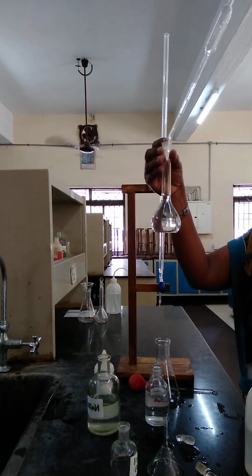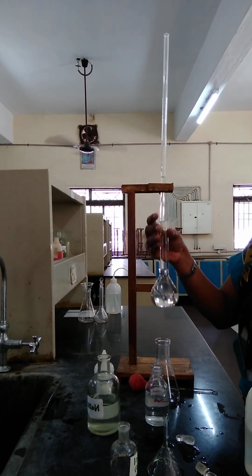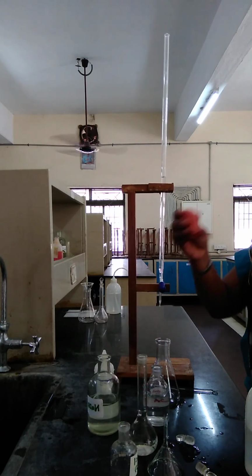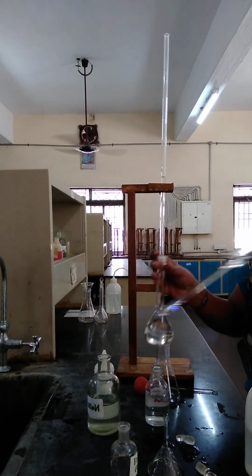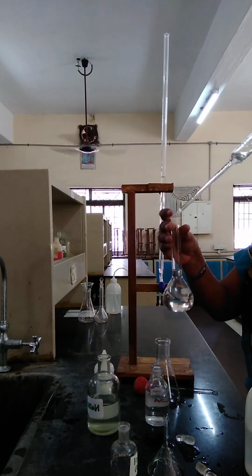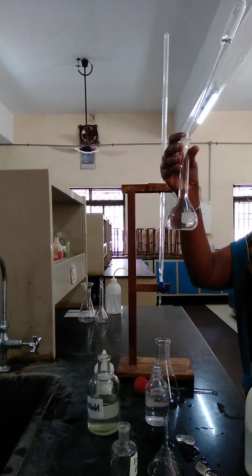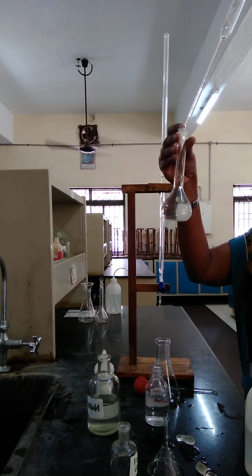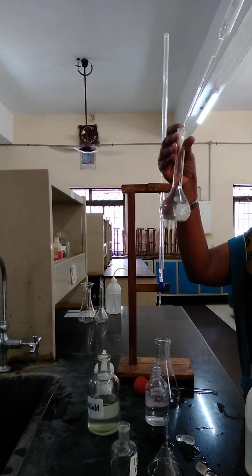In the picture without water sample, you can add the water through the wall. It gives a very clear addition of distilled water, whatever amount we need. Slowly add it, dropwise. You can clearly see it rising very slowly and the level increasing. When it comes to the mark, since the solution is colorless, we keep the lower meniscus.